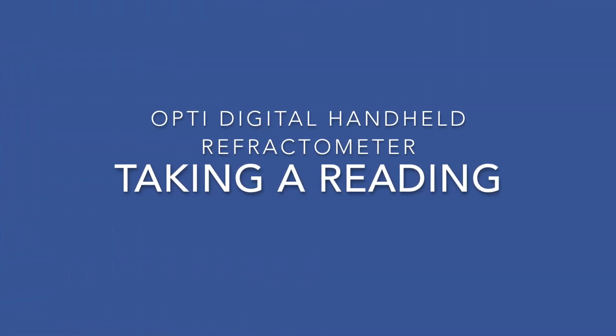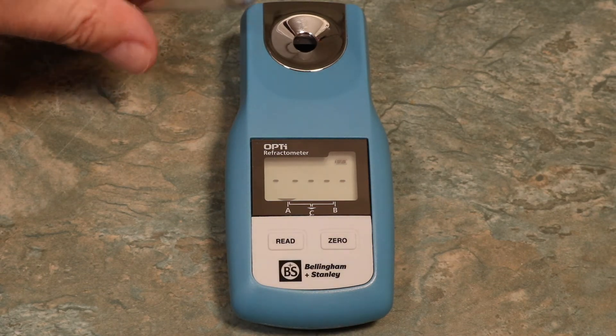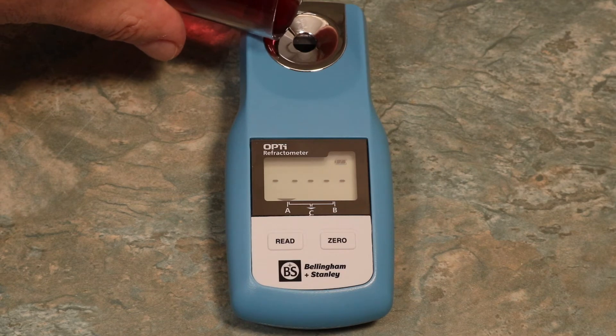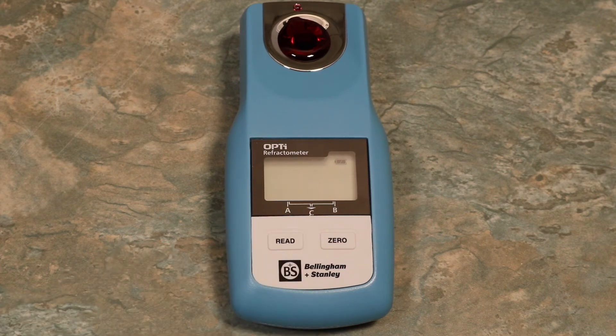The Opti was designed to take quick readings and to be easy to use. Switch on your Opti by pressing the Read button. On startup, your Opti will briefly display your three loaded scales before being ready to use. To take a reading, simply apply your sample either by pouring or using a pipette. Press the Read button. After just two seconds, your Opti will display an accurate reading. Here we see a Brix reading, as was loaded onto Scale A.